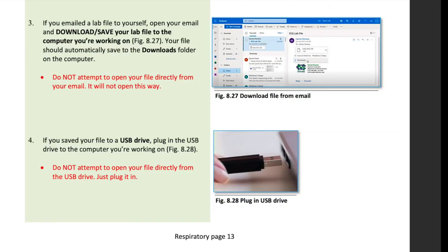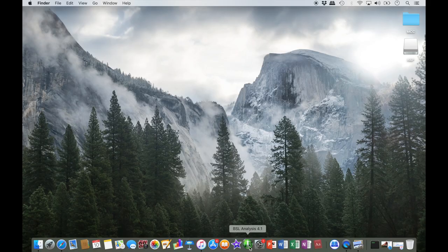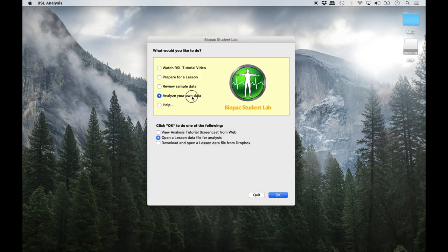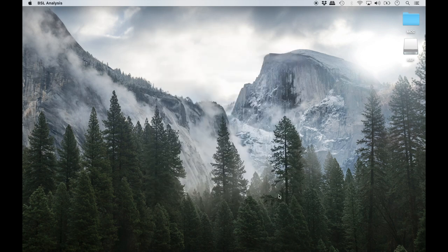If your respiratory lab file is on a USB drive, plug it into the computer but do not try to open it from there yet. Now open the BSL application. In the window that opens, select 'Analyze your own data' at the top of the window and then 'Open a lesson data file for analysis' at the bottom, and then click OK.